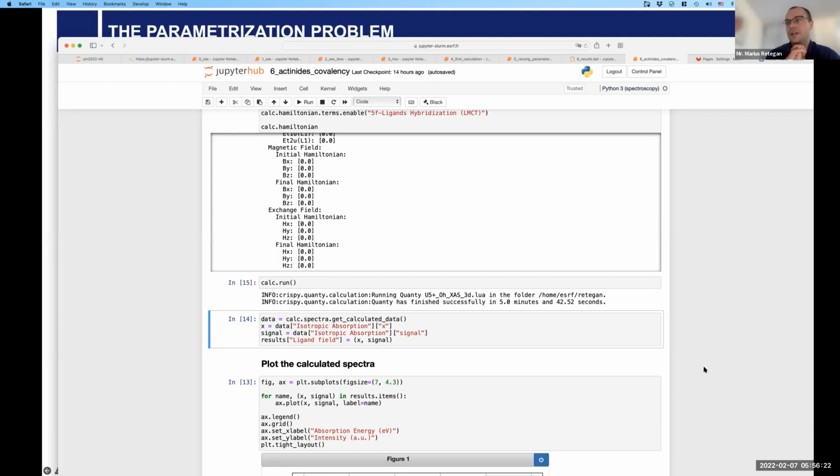Even if you look at XAFS Viewer that Matt Newville is building, it's fast, it has tons of features, but there can always be little quirks in the interface that are not how people want it to be used. And people ask, why is it different from Athena? Why does it not look exactly the same?